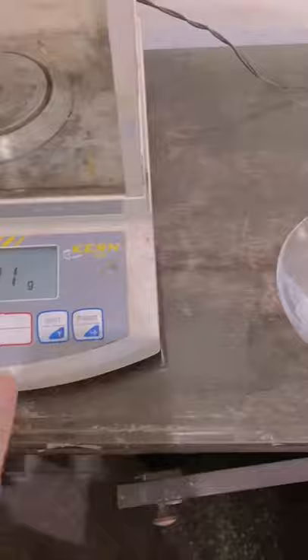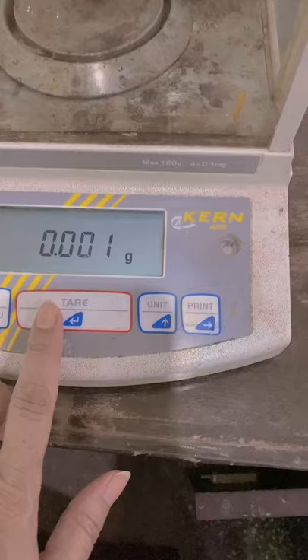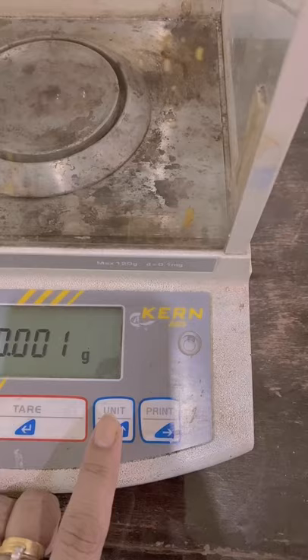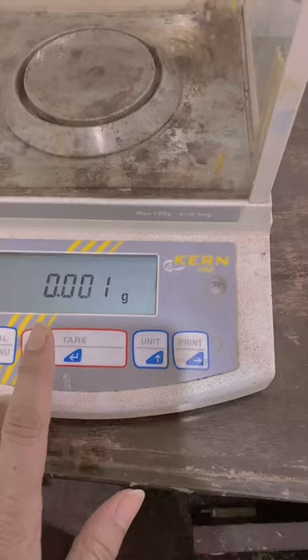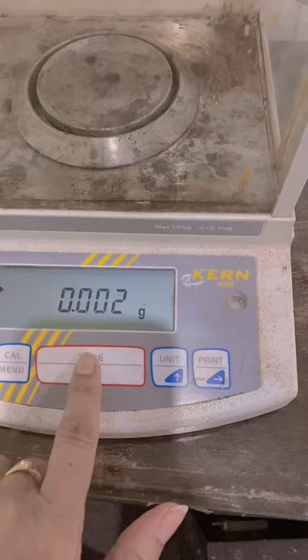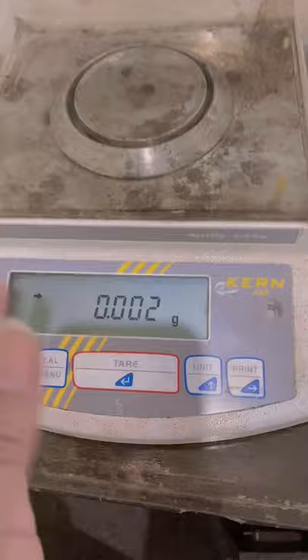This is a top-loading balance that permits quick and easy measurements. It is electric and displays a digital readout. It also has a tare function — T-A-R-E. There's also the on/off function, menu, units, and printout options. The tare feature resets the balance back to zero when pressed.